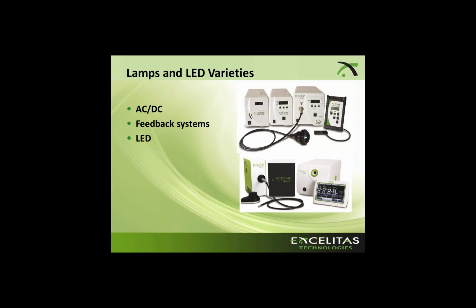So I just briefly want to talk about the different lamps and LED varieties in relation to stability. You have AC and DC lamps, which are basically bulb-based. You have feedback systems, which will keep the intensity stable throughout a defined amount of time. And then you have LED systems, which are the fast on and off, and we'll have a look at the stability of those as well.